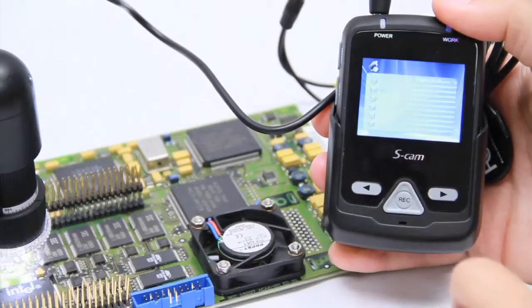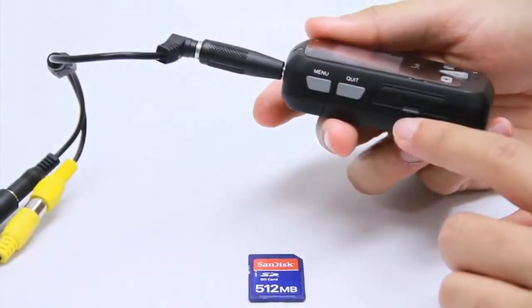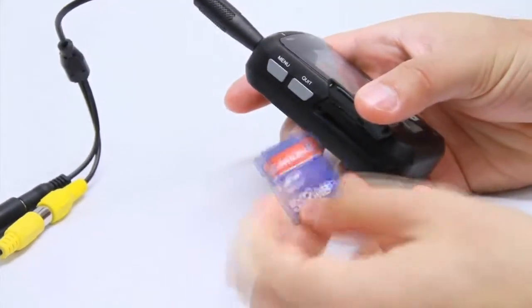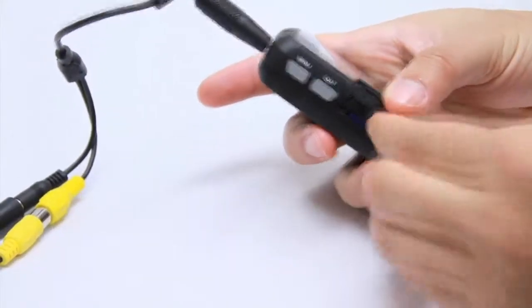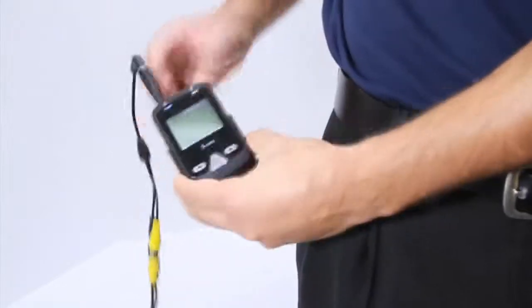Our portable viewing system also comes with a rechargeable battery. This portable unit comes equipped with 8GB of built-in memory and also gives you the option to use external memory. The highly mobile MS-D09 can be securely clipped onto your belt or pants.